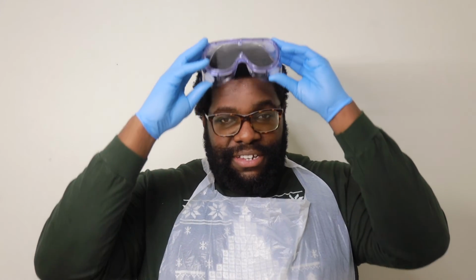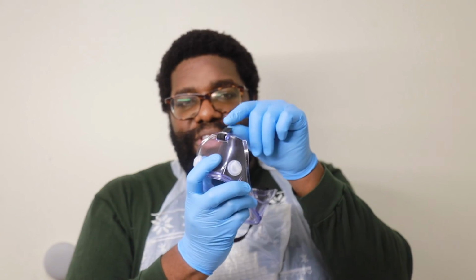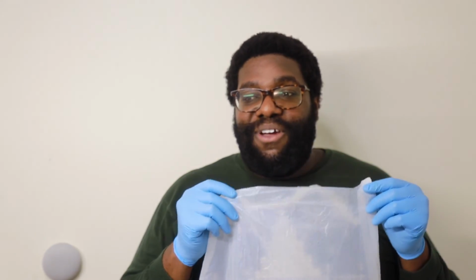So after the experiment's done, you can remove your goggles. Quick note to point out with your goggles, if your string falls out, you can thread it through here and tighten it by pulling here. Remove your apron. Remember to keep your apron, it's the only one we have, and remove your gloves.